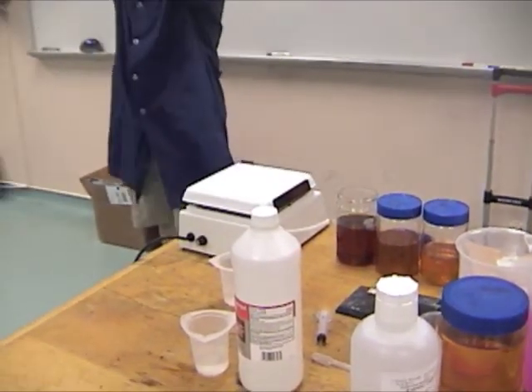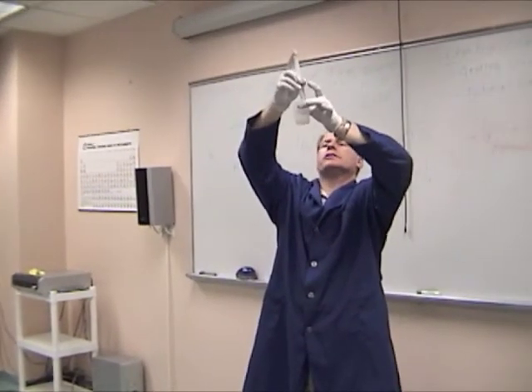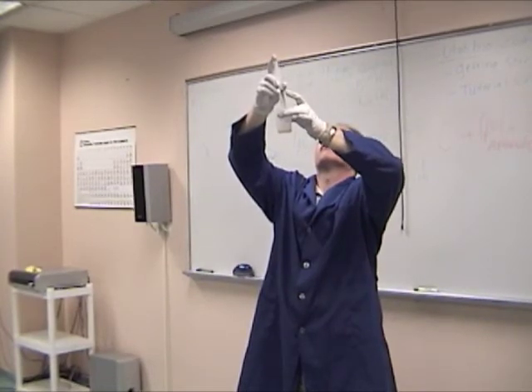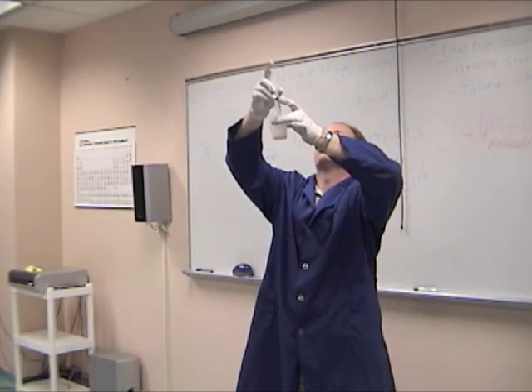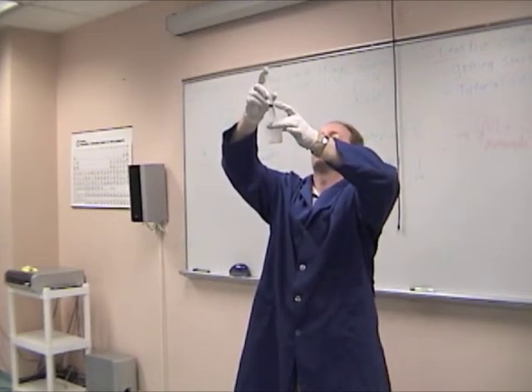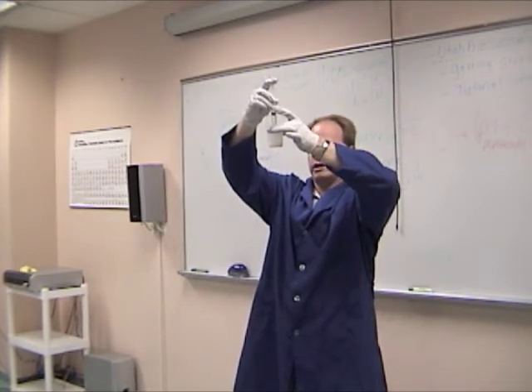So that everyone can see, I'm just going to start dropping stuff in. Now, I don't know if you can see it, but there's slight things of purple coming on here. A lot of times it will go purple across the liquid that's dropping in, but it doesn't mean a thing. You've got to get the whole thing purple and stay there for 30 seconds. Ooh, this is bad oil.